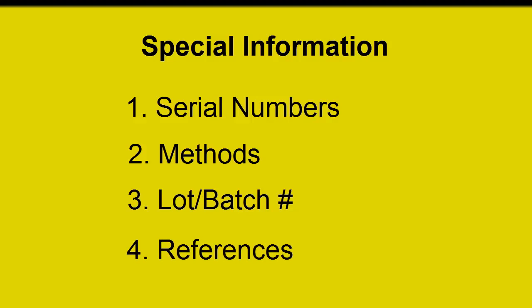Finally, you want to make sure that you include all the reference information that a person might need to repeat your experiment. For instance, you may be using a company SOP, or maybe you're using a procedure that came from a journal article. In both cases, you want to make sure that anybody repeating your experiment will be able to obtain that information readily.